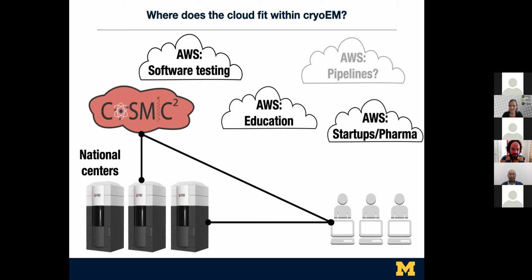All right, since you said you wanted to know what people want, there are a couple of questions about, is there a plan for integrating M? It would be great, but that requires Windows. Unless we use the Linux modified version that I've seen people talk about on Twitter, we can't do it. In Exceed right now, there are no Windows machines, so we can't do Warp or M unless we somehow did what I think I've seen Takanori trying, running it in Linux, but I haven't seen the latest.